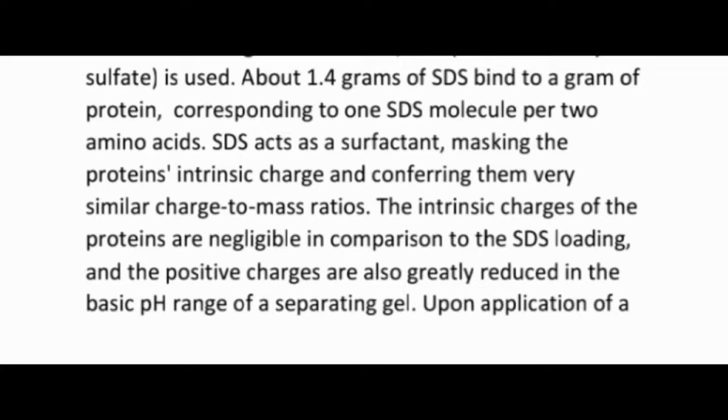The intrinsic charges of the protein are negligible in comparison to the SDS loading, and the positive charges are also greatly reduced in the basic pH range of a separating gel. Upon application of a constant electric field, the proteins migrate toward the anode, each with a different speed depending on its mass. This simple procedure allows precise protein separation by mass.